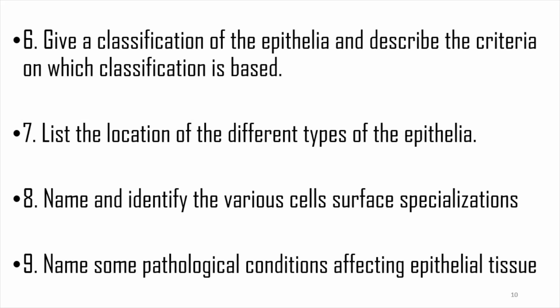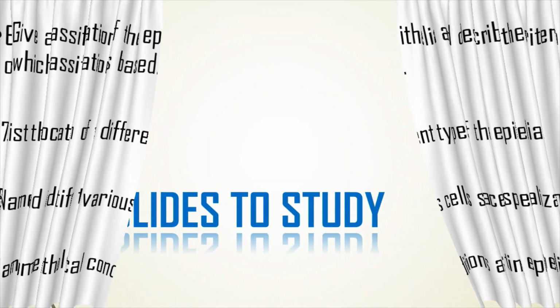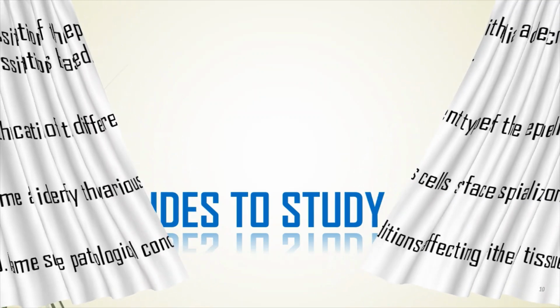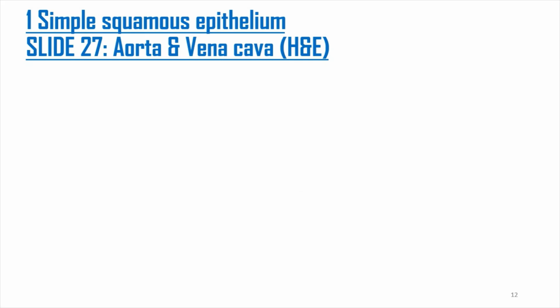And lastly, to name some pathological conditions that affect epithelial tissue. Now let's look at the slides that we're going to study in this lab. Okay, so number 1, we're going to do simple squamous epithelia.